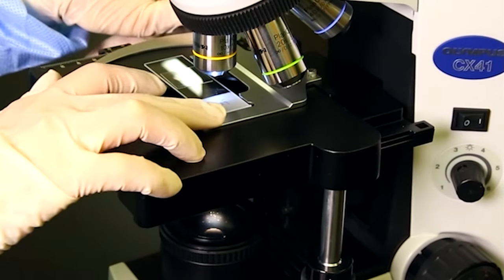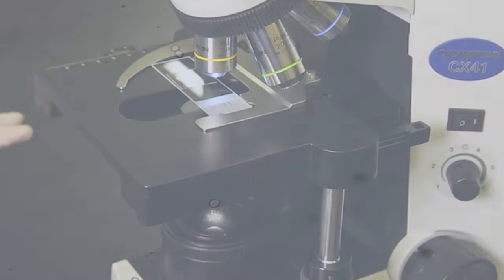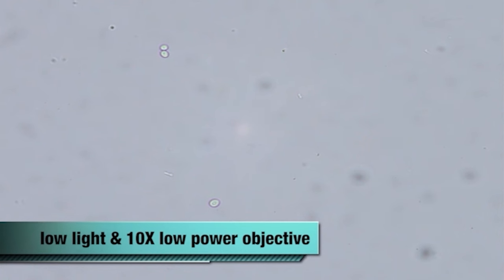Place the microscope slide on the stage of a bright field microscope. Focus the microscope using low light and the 10x low power objective. Scan the entire microscope slide, reading at least 10 fields using an S-shaped viewing pattern.